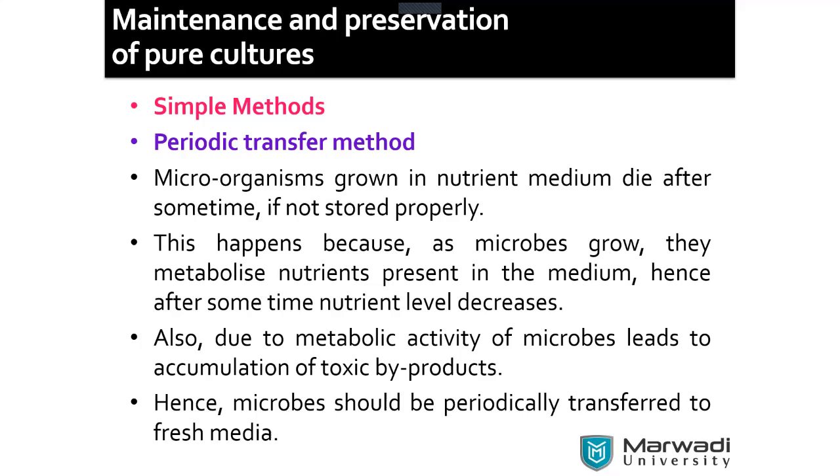In the periodic transfer, monthly, generally it is required. Sometimes twice a month, or 2 months, 6 months, as per our capacity. We have to check whether the plates are depleted, whether the given microbial material is there or not. Nutrition availability is depleted, that is one thing. Another, you have to check continuously whether it has any contamination or not.